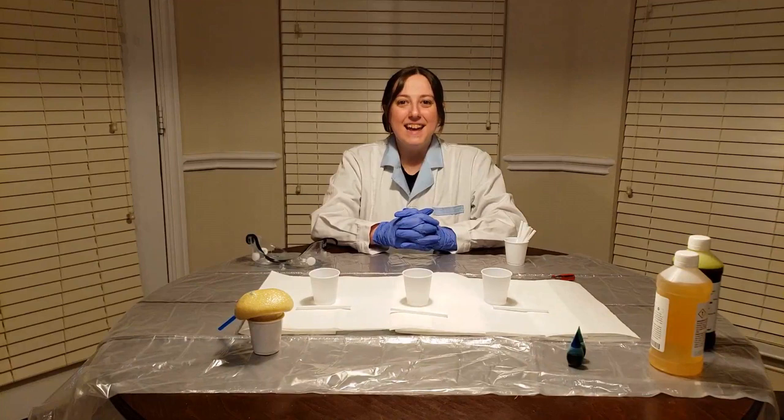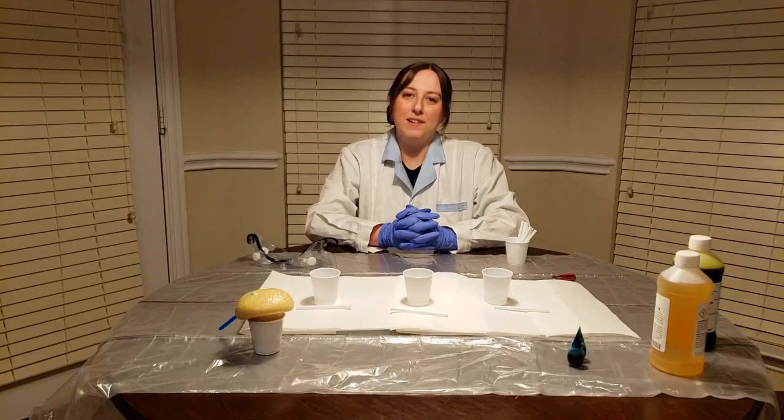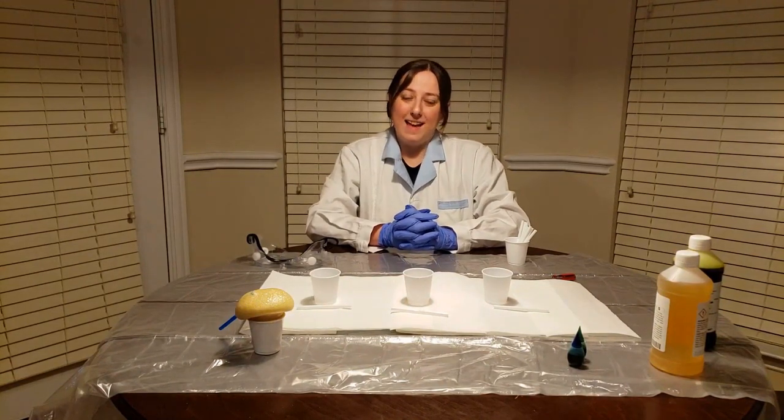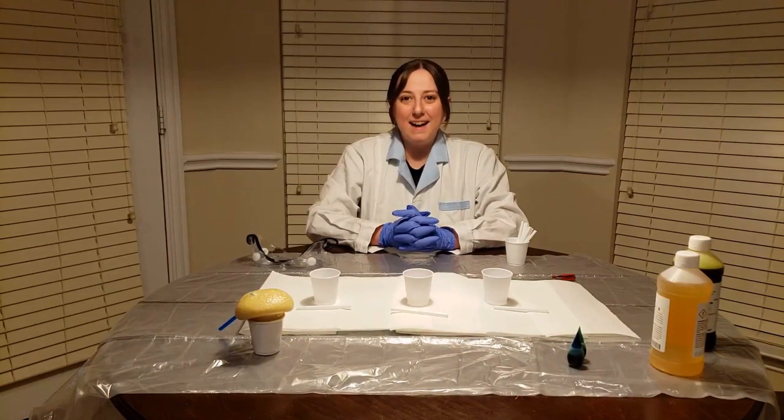Hi guys, thank you for joining our video today. Today we are going to be doing a foam lab. It's going to look something like this little guy in my cup, and we're going to go through it step by step. If you are doing a lab like this, it is science chemicals, so you want to make sure that you have your gloves, you have your goggles, your hair tied back, and that you're being safe. Let's get started.